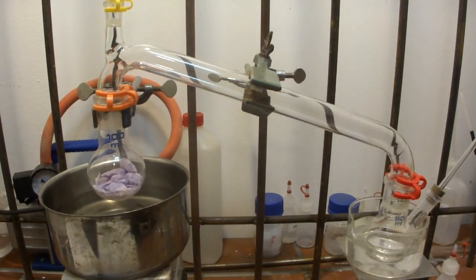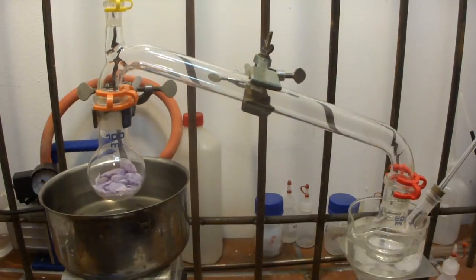So just a few words about trioxane. Why would you want it? So trioxane is a very useful compound if you want to make, for example, phenol formaldehyde resins, where you take very reactive phenols, and trioxane is just a less reactive form of formaldehyde. Also, there are a lot of reactions where you have to take anhydrous formaldehyde, basically, so you can easily dry and purify trioxane instead of using the regular formaldehyde solution, which is of course not possible to dry, or it is very difficult to purify.